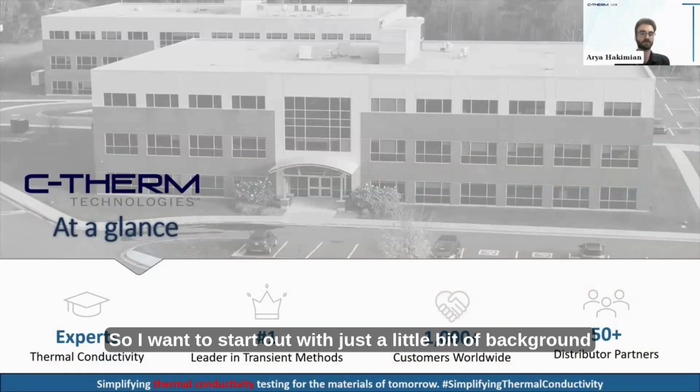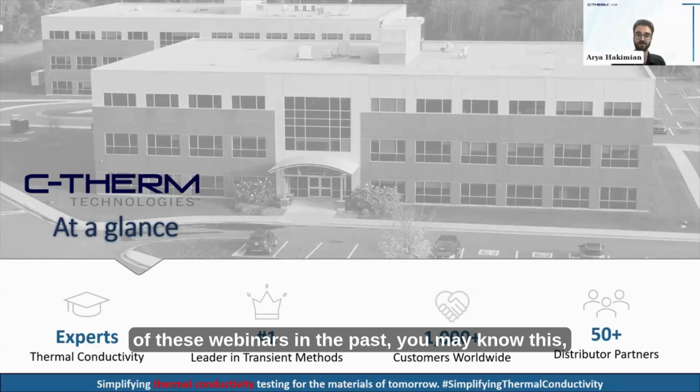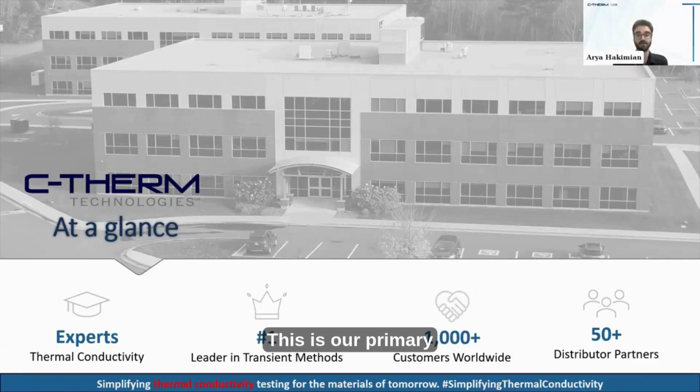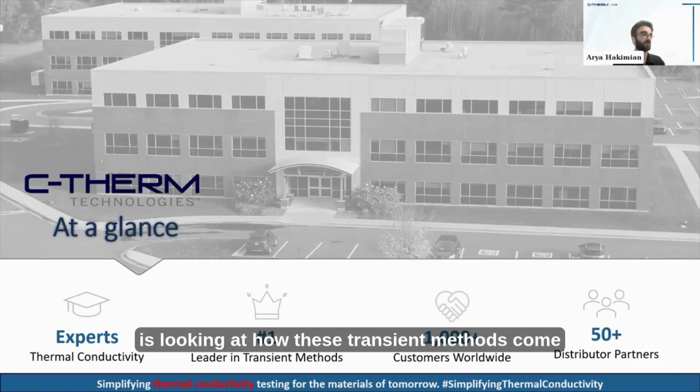So I want to start out with just a little bit of background before we go into the core of today's content. For those that may have watched some of these webinars in the past, you may know this, but for those who are new, C-Therm, really at our core, focuses on thermal conductivity. This is our primary focus: the characterization of a range of materials, all under the guise of thermal conductivity, specifically using transient methods. So that will really be at the core of today's session, looking at how these transient methods come into play, where they're most applicable, and of course, going into some examples with that.